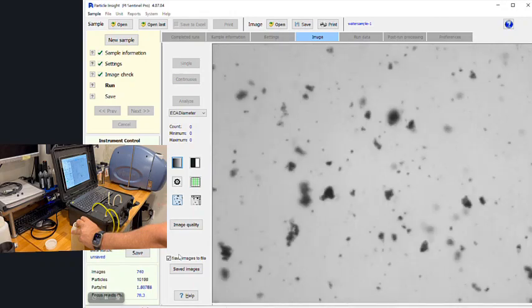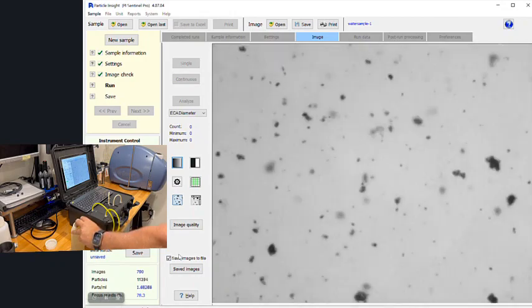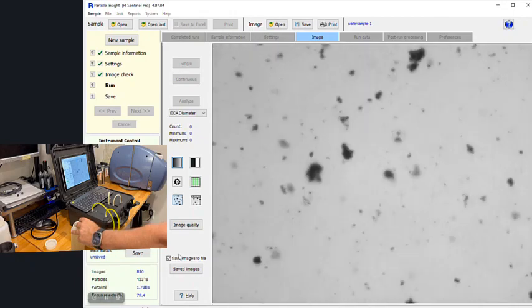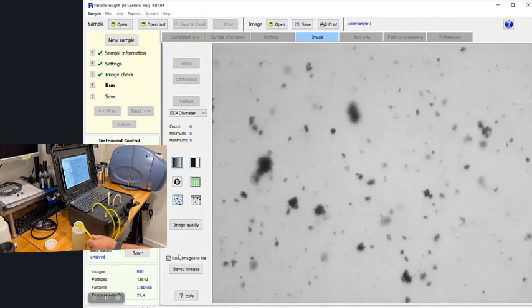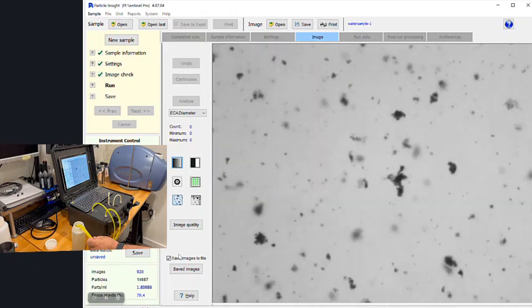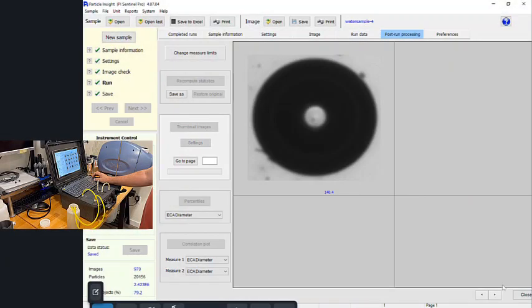So images are being taken. As these images are being taken, rejections are being done based on whatever parameters the user sets. And 32 plus shape measures are being analyzed, and statistics are being updated. And then every particle has a thumbnail saved as objective evidence to be viewed later. But it's also very important to see on the lower left of the screen, there is the measure of concentration. So especially for water quality applications, concentration is very important, knowing the amount of particles you found per unit volume, per ml.